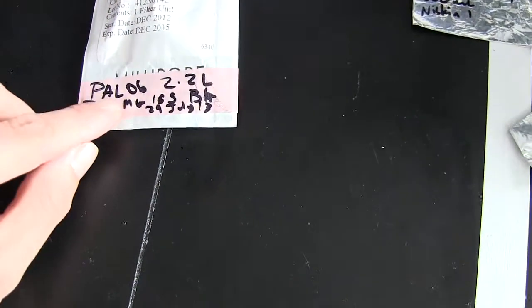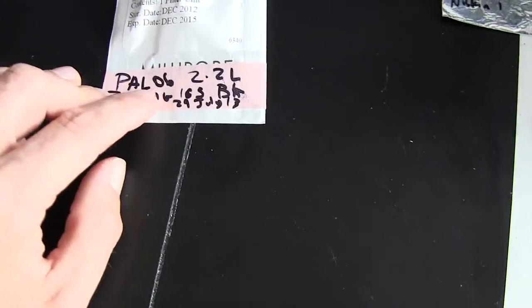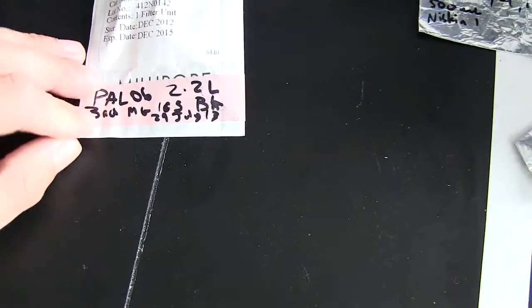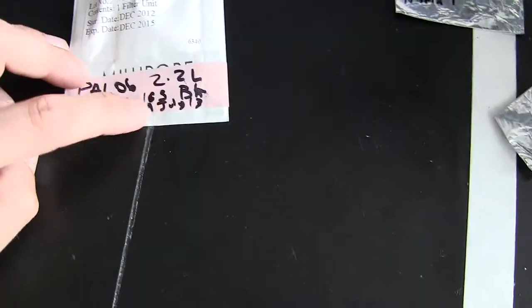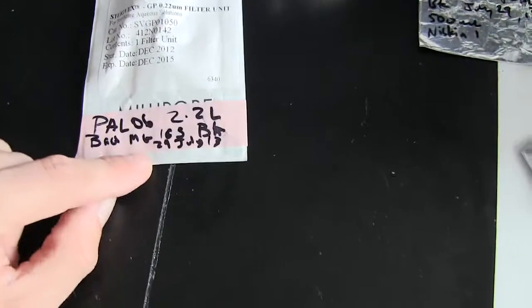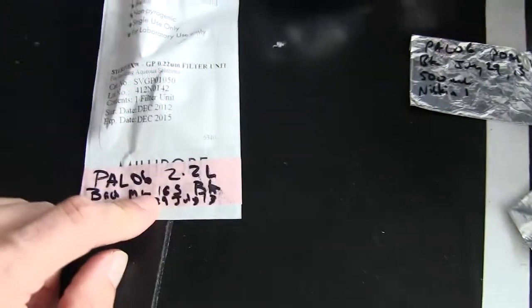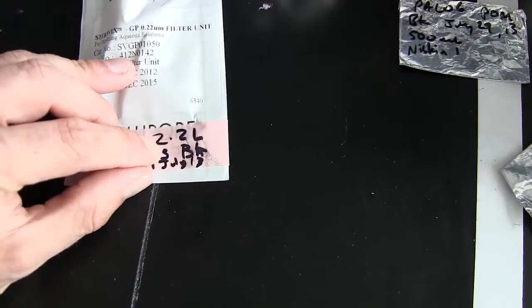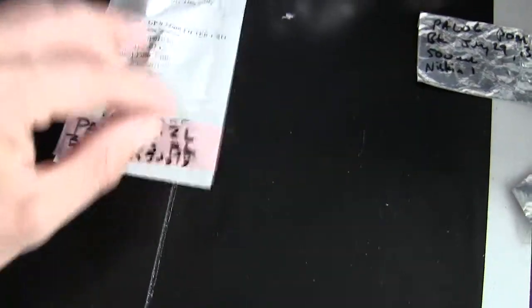Alright, after you've put all the remaining water from your water chemistry set per site through one of these Sterivexes, per site again, you want to label it. I write on the actual container, on the packaging here. Again, you've got site, you've got the nature of the sample, in this case bacterial metagenome 16S, my initials, and the date. You don't have to write the Niskin bottle number on here because you pooled across both Niskins. However, always write down the volume that was filtered through them. Usually it's something like 2 liters. Okay, so that's the labeling for the water chemistry work that you've done out of your Niskin bottles.